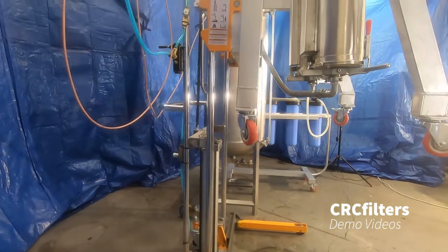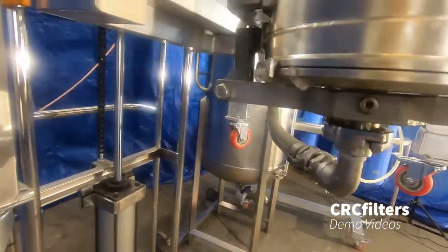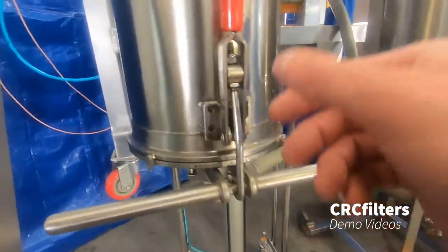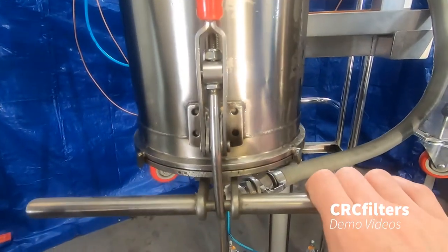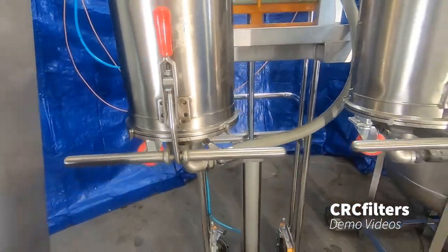To unload, you can see on the bottom here these are hinged — there's a hinge right here at the back and a lever right here. You just pop that open and the bottom drops down so we can unload both of these pretty easily.